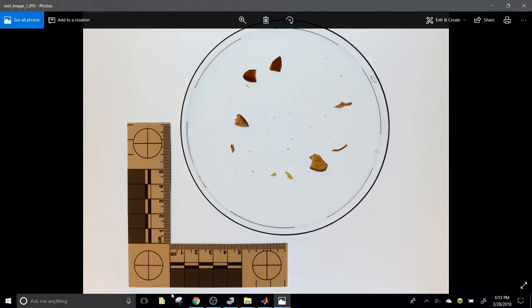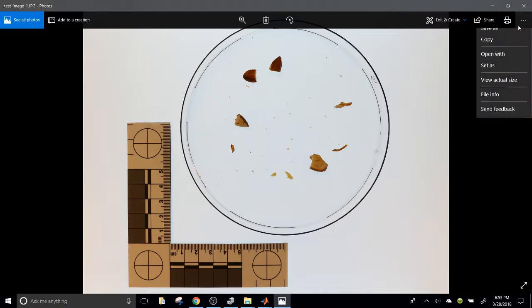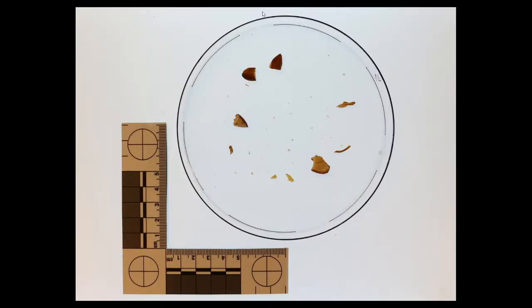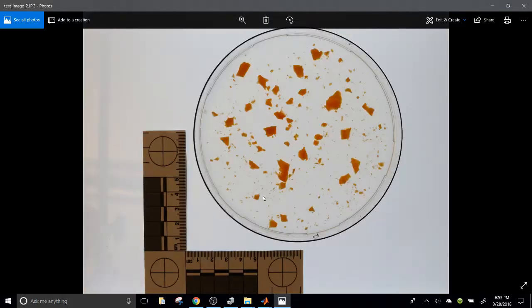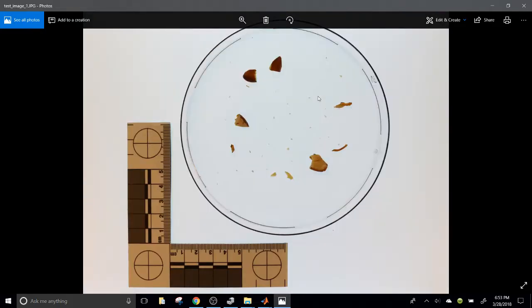Now the last thing is you notice how there's a little strip of white on all sides. It may not really look like it because of this weird toolbar on the top, but if you set it as slideshow, you can see how there's white space above this too. Okay, so that being said, if you look at this other image, you can see that the scale is hanging off the edge of the image a little bit, and we'll see that it'll deal with that. It won't actually matter, but it's best if you have it all within the field of the image like it is here.